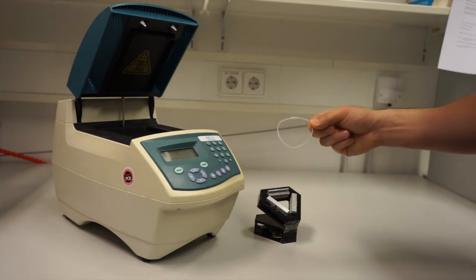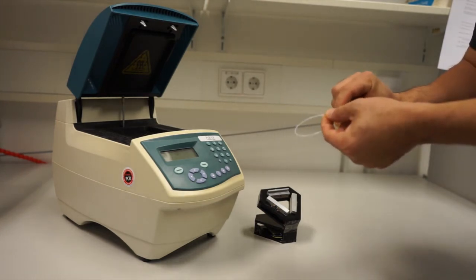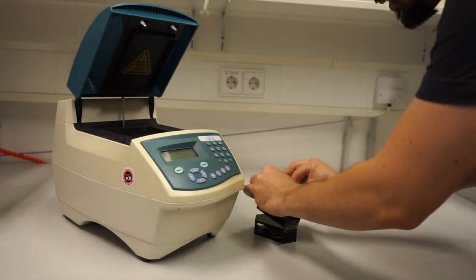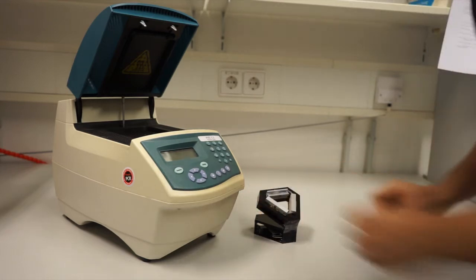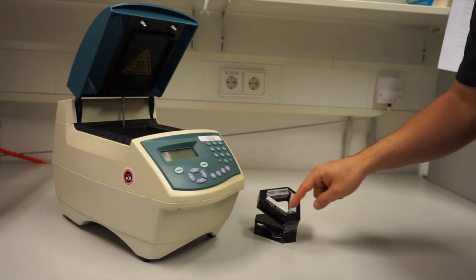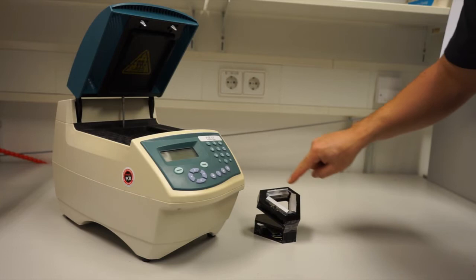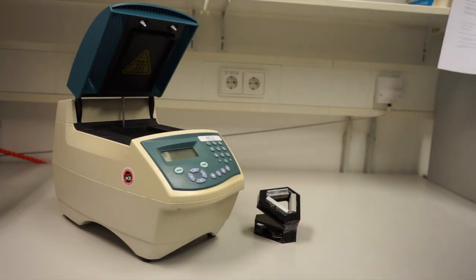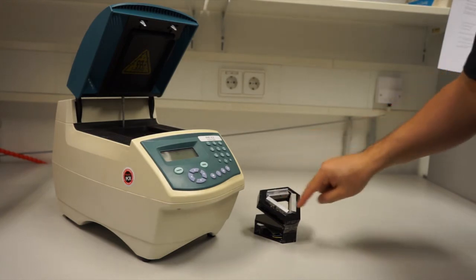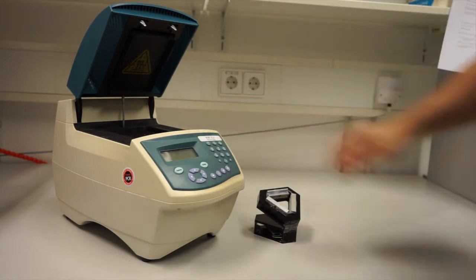All we do is we put our sample into a cheap piece of Teflon tubing, held together by some silicon tubing, and mount it into the device like so. Because the denaturation temperature is so much higher than the other 2 zones, convection forces the liquid upwards and it moves them in a loop. This happens pretty quickly, so 30 rounds of PCR takes only about 30 minutes as opposed to about an hour and a half on a machine like this.